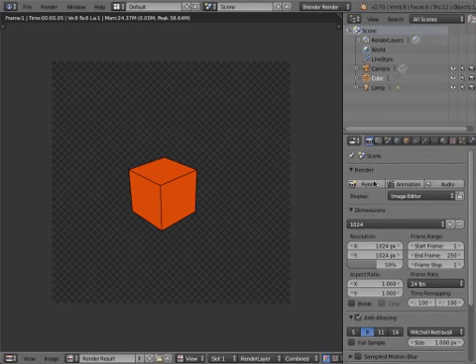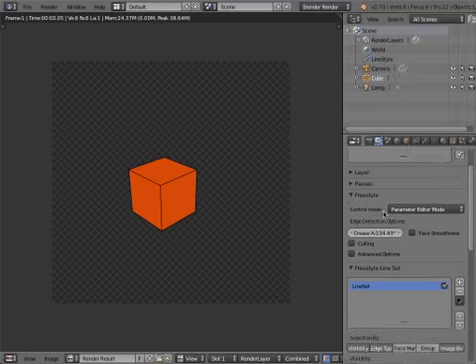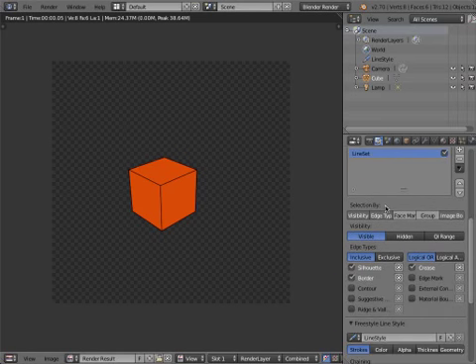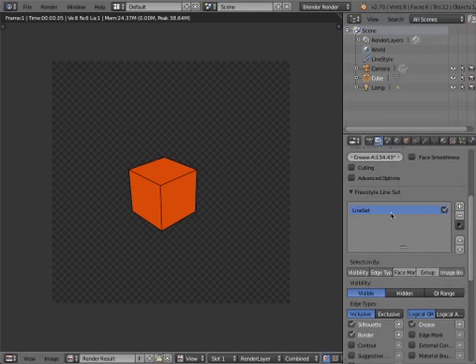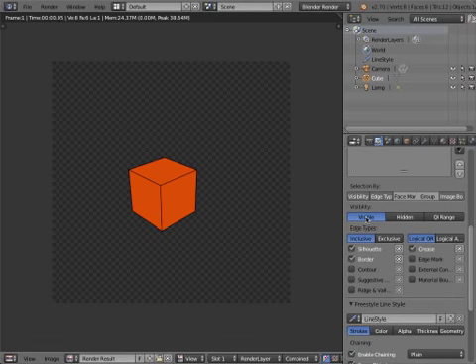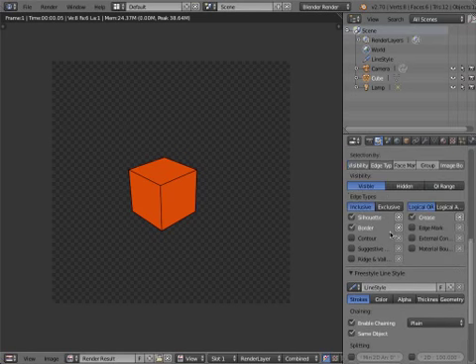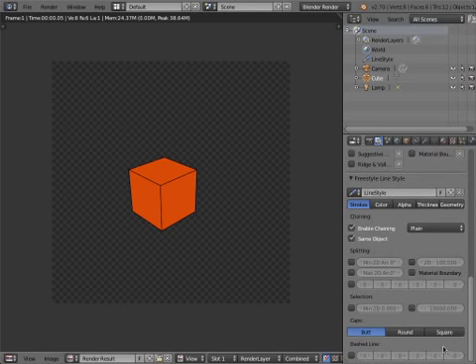And with Freestyle, you actually get your Freestyle options in a second tab, in the Scene tab. So you can see there's different options of line sets. So right now we've just got the visible line set on. So all of the visible lines, including silhouettes, borders, and creases, are rendered as a solid 1-point line, or whatever it was set to, 1 or 2 point.